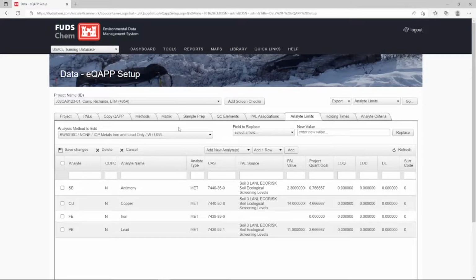However, if you have a test with many analytes, it can get tiresome to go through and update the limits for each one individually. Instead, you can export the analytes as a pre-formatted spreadsheet, update the numbers in the spreadsheet, and import it back into the system. You can also send this spreadsheet to the lab and have them fill in their limits, and then upload it into the system.